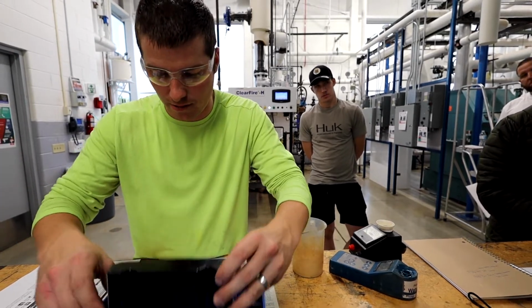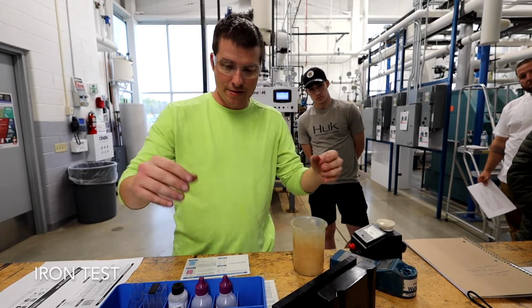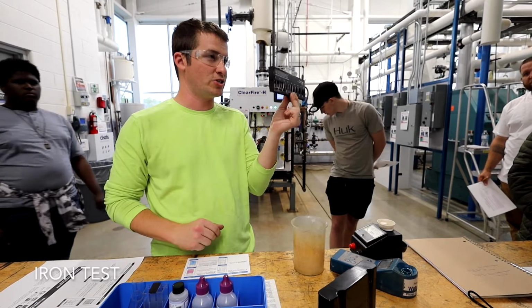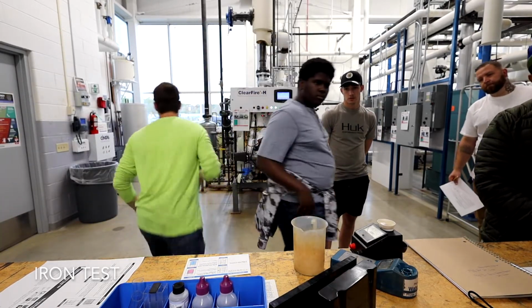Okay, let me grab this out. Now, this iron test is obviously much more basic. It's a color change test that we're going to look at visually.